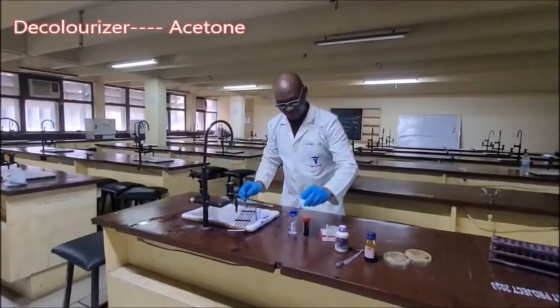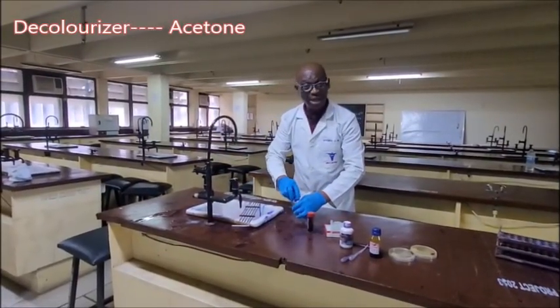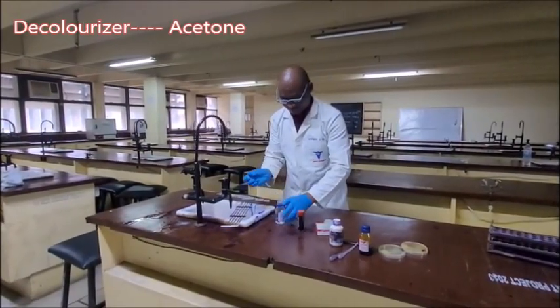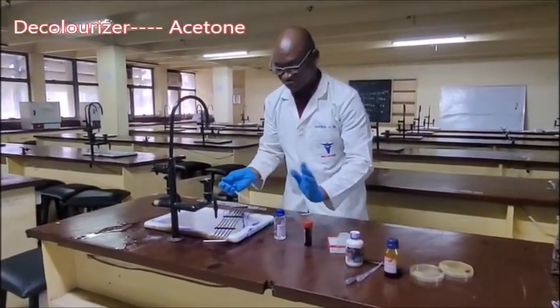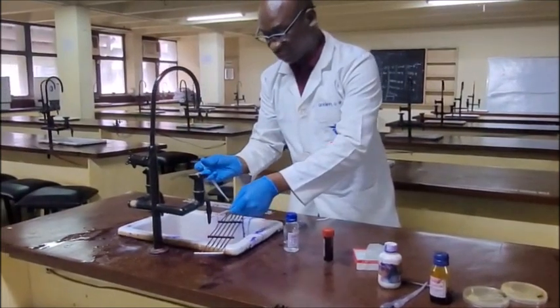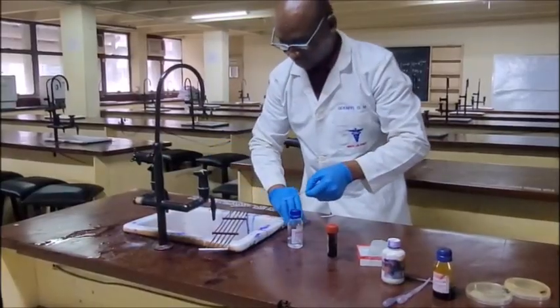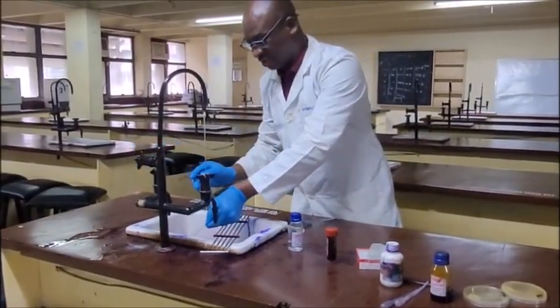Then you apply your decolorizer, which is acetone. You need to decolorize briefly so that the smear does not wash off — just apply a few drops on it. Then you quickly rinse again under running tap water.